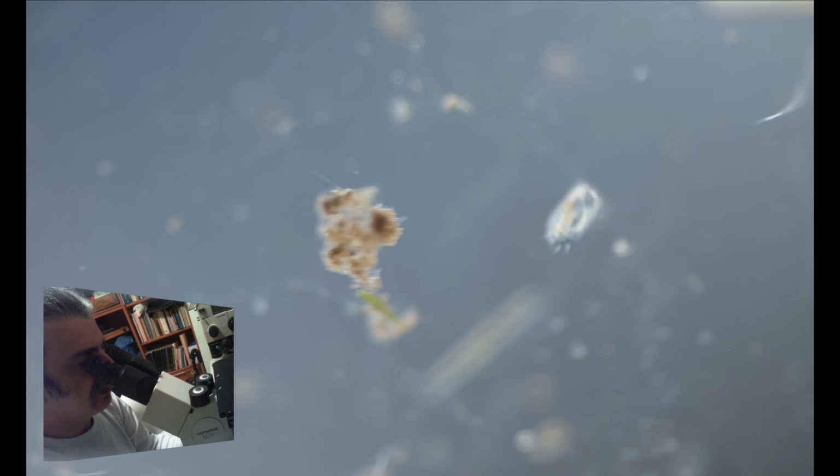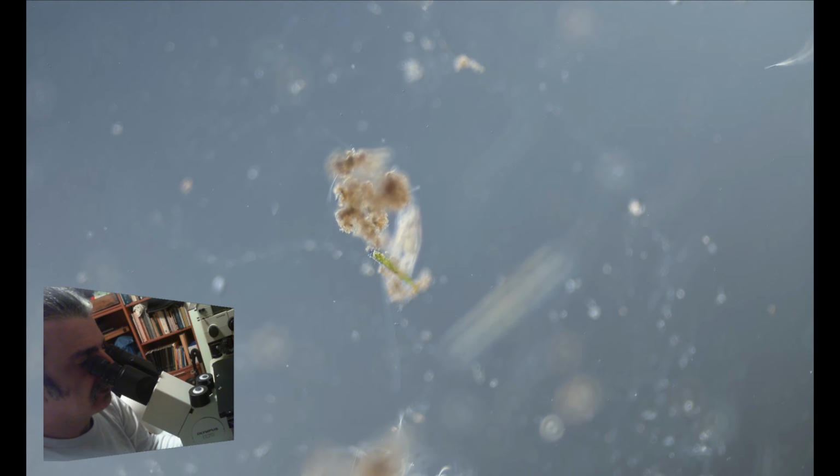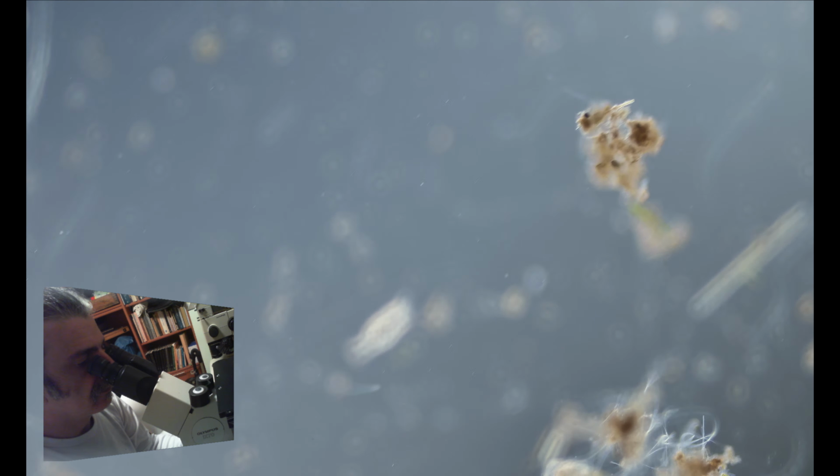Euplotes. Watch how it uses its cilia-like legs to climb on things. Rotifer.